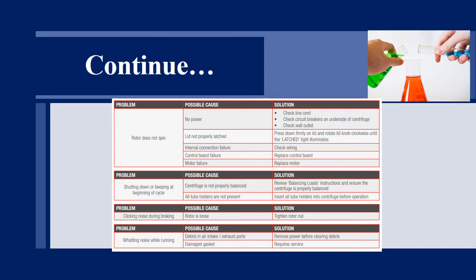Third cause is internal connection failure, so we have to check the wiring. Rotor does not spin maybe due to control board failure, so we have to replace the control board. Rotor does not spin, it can be possible that the motor has failed or there is damage in the motor, so we have to replace the motor.